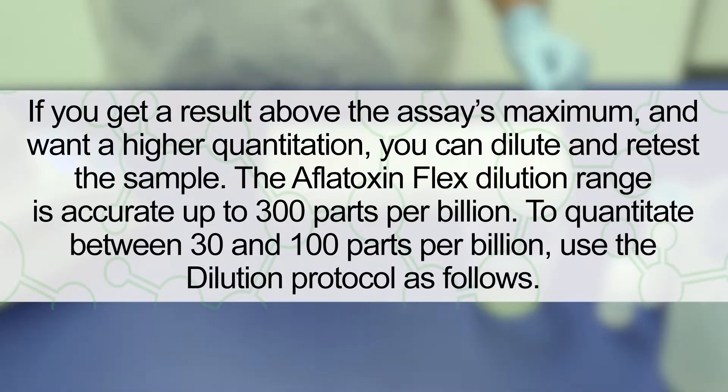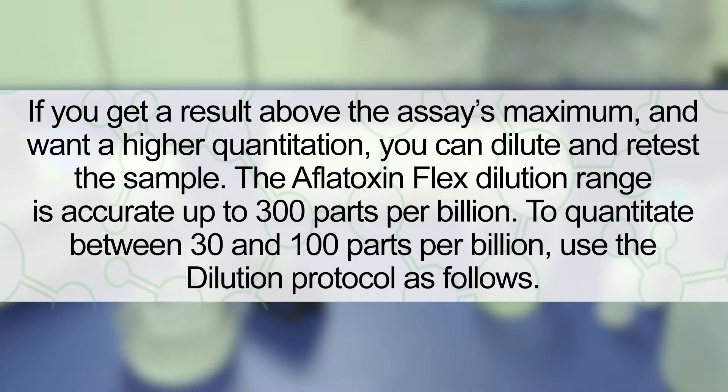The Aflatoxin Flex dilution range is accurate up to 300 parts per billion. To quantitate between 30 and 100 parts per billion, use the dilution protocol as outlined in the product insert for the specific matrix. In this video, we are diluting a corn sample.